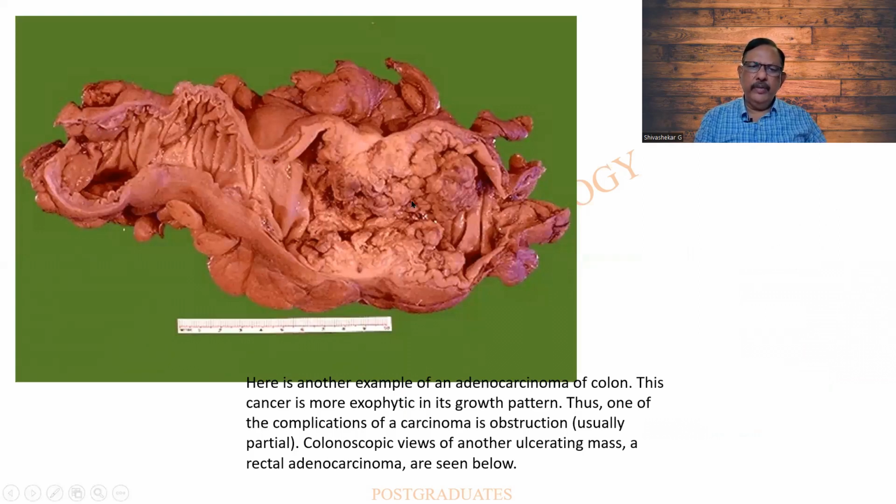Thanks to web pathology for this picture. Look at this one. I'm able to see a colorectal carcinoma. This region is quite far off and it is free of tumor, whereas here it is friable, a lot of narrowing is seen, and there is also a thickening of the wall. And the surgical resected margin is only a few centimeters or even 1 centimeter away. Therefore, this will be of paramount importance than this. So mechanically, do not do one margin after another. You people will have to be judges.